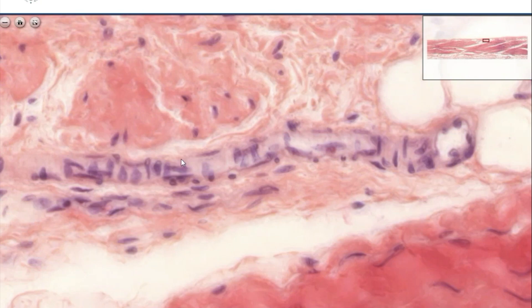This is a longitudinally cut arteriole, where you see the endothelial cells positioned longitudinally, and you see the smooth muscle cells around this arteriole.